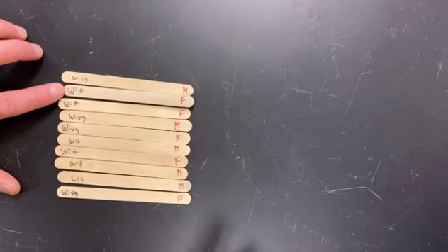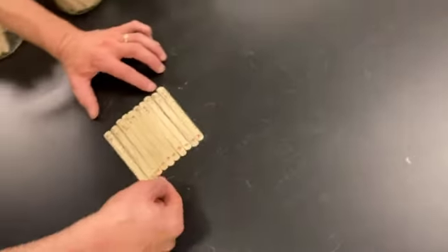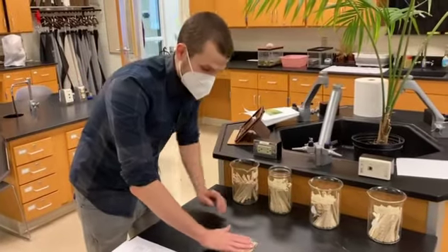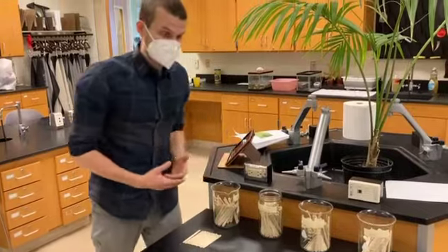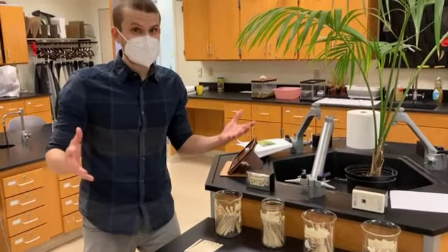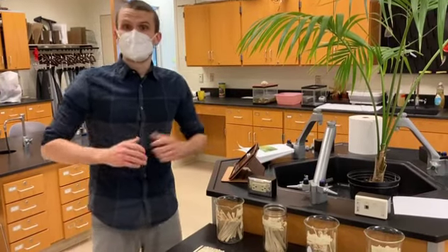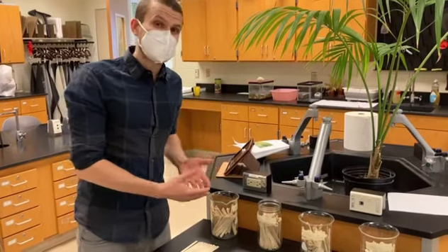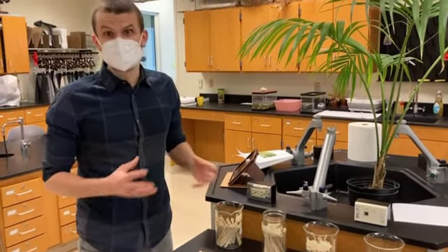So now what we're going to need to do for each one of these sets is count out how many males and females we get and how many vestigial and wild type we get. This is going to be our pool for this set. Then I'm going to go through and collect 10 popsicle sticks for each of them. And then because the class needs to operate with replacement, you will take the popsicle sticks and put them back. If you're doing this lab completely virtually, we will show you the statistics or the counts for the progeny after I pull out 10 popsicle sticks from each station.